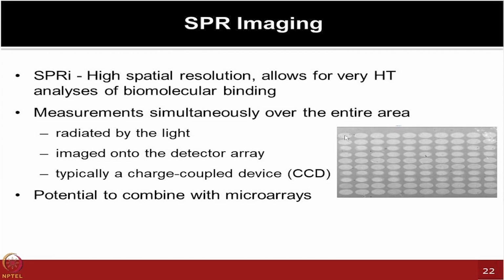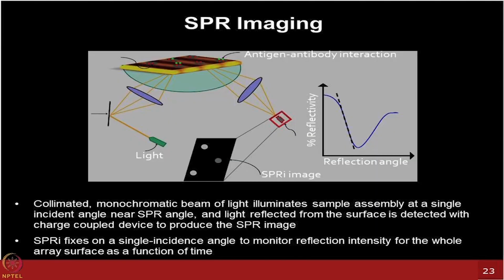So, this is one of the images I am showing from one of the experiments I was doing in Josh lab earlier when we were developing some SPR imaging based platform on the early prototypes. So, as I mentioned to you, you are seeing just the pseudo image. It is not the actual, you are not measuring fluorescence. These are some of the pseudo images obtained from this kind of platform which shows you compatibility with SPR imaging.